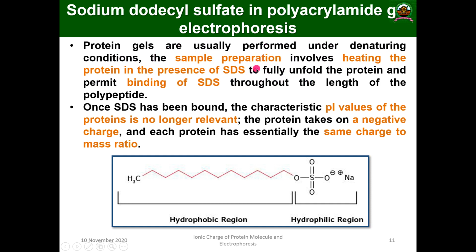Okay, so what is the reason? To fully unfold the protein and permit the binding of the SDS. You know that the native form of the protein is fully folded. We will discuss that. When you are adding SDS, denaturation will take place and the SDS will bind throughout the length of the polypeptide.